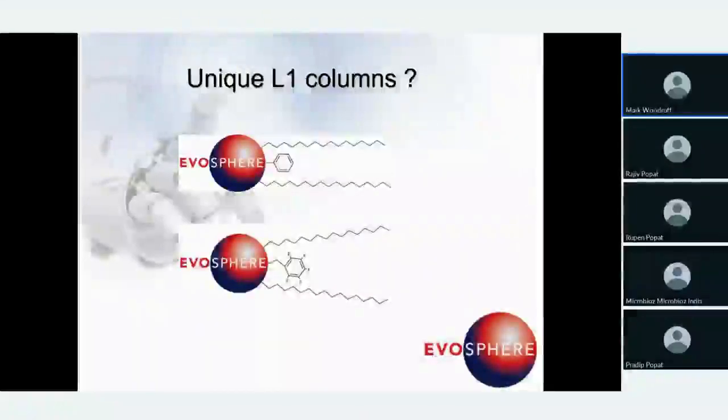So you only really have one mechanism of interaction, the hydrophobicity, to gain your resolution and selectivity. Here we have 2 choices that are both in the L1 category in the USP, but with multiple interaction mechanisms. So hydrophobicity, pi-pi, aromatic, and also some shape selectivity.